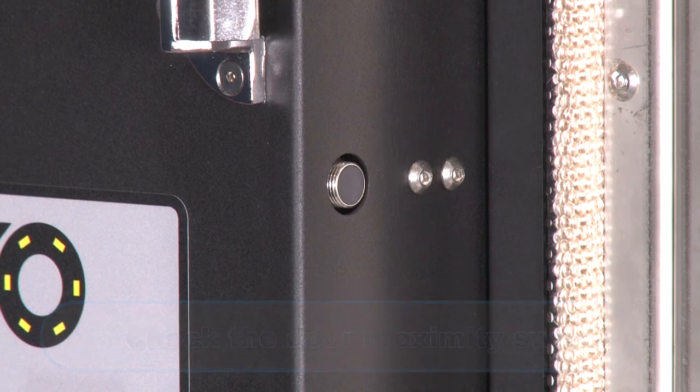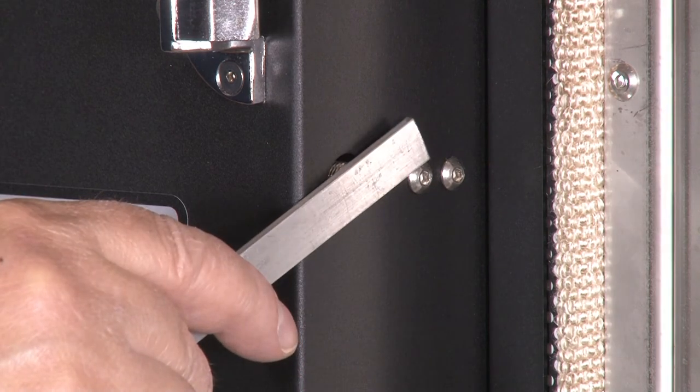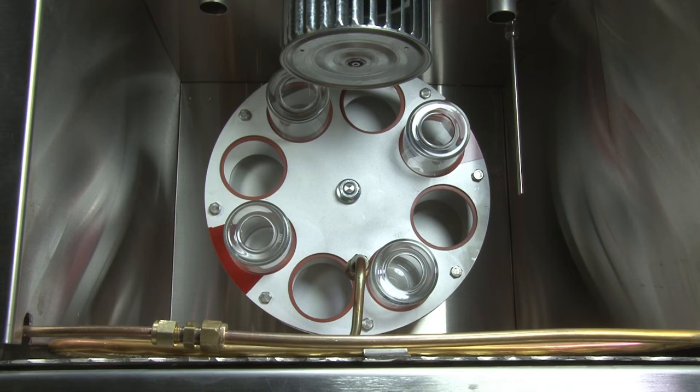With the door still open, place a metal device on the proximity switch. This will mimic a closed door. Now, with the unit turned on, see if the carousel rotates. If the carousel still will not rotate, you need to check the proximity switch adjustment mechanism.